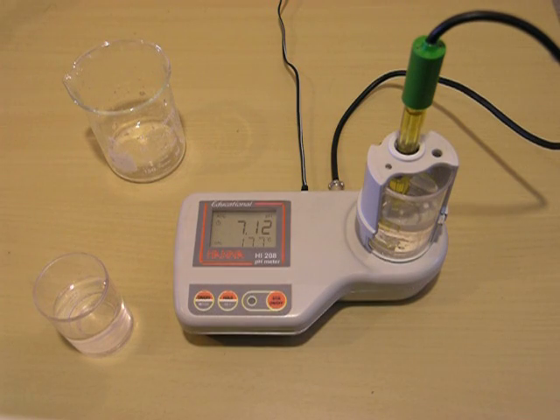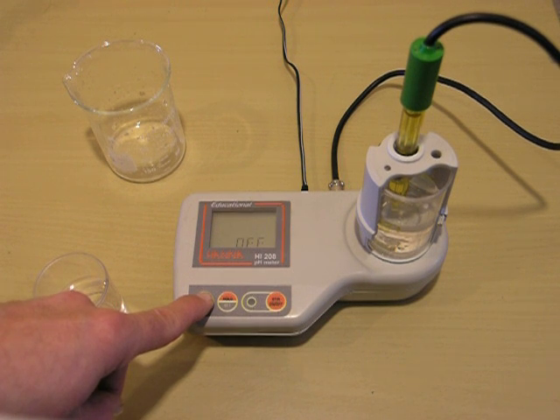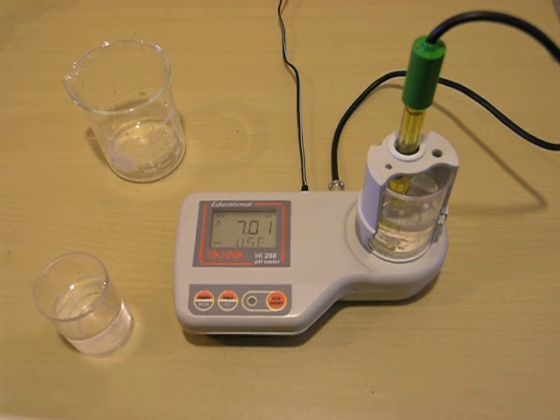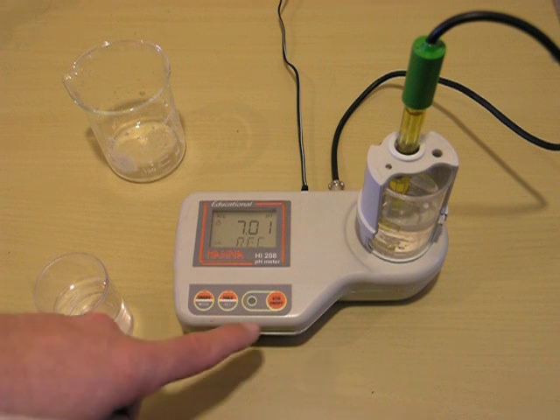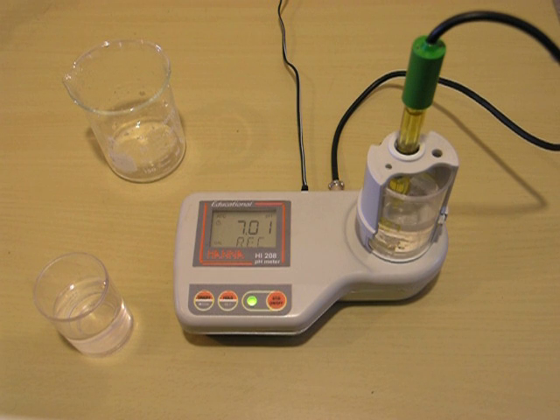Now we're ready to put the machine into calibration mode. You'll simply hold down the on-off button until the word CAL is on the screen and then let go. We're in pH buffer 7 right now, so we'll turn on the stirrer. The machine will let us know when we're calibrated at 7.01 and ready to go to 4.0.